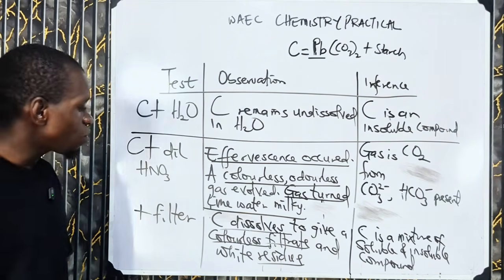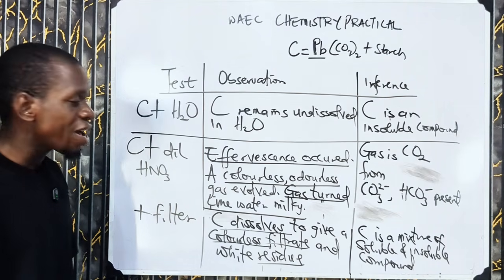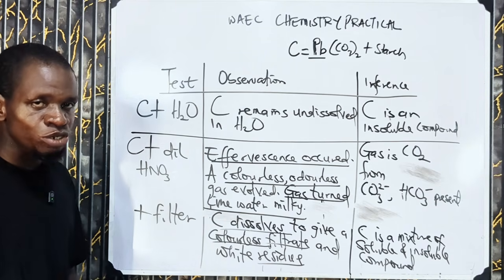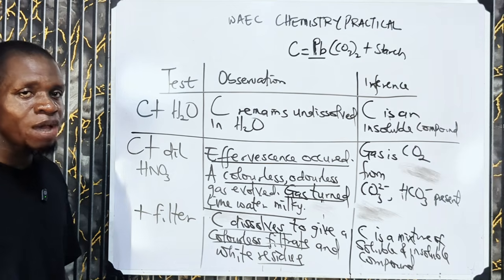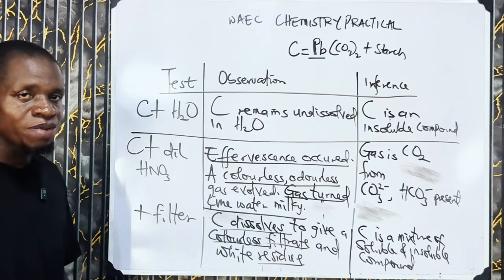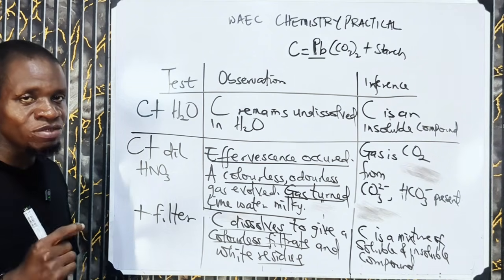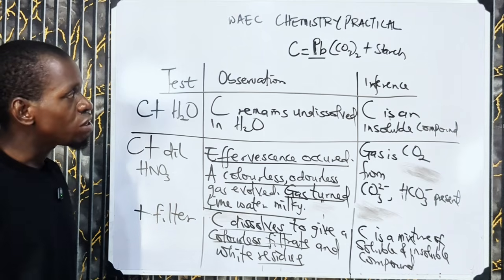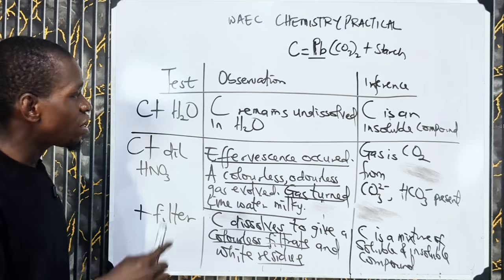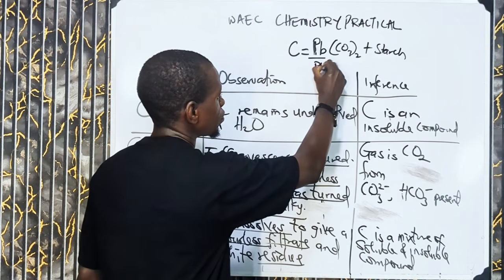All right. Now the next thing we're going to do, since we have done this, is that they might ask you to divide your filtrate into, let's say, 3 portions or 4 portions, depending on how many portions you are asked to get. Maybe to the first filtrate, add sodium hydroxide. What is it going to give you? Remember that for the first one, lead carbonate reacted with HNO3.